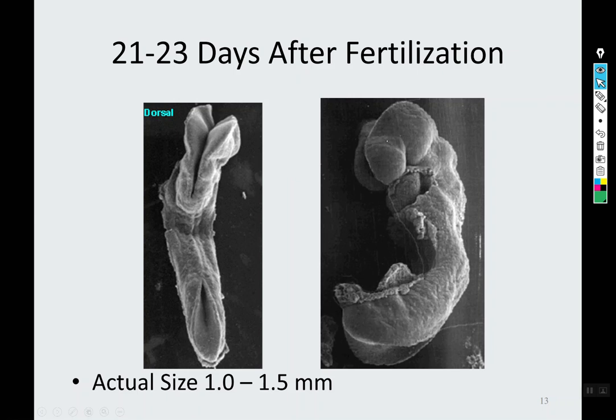This is going to end up becoming the brain and head. This is going to become the thorax and heart. And there's other midline stuff happening in here. So it's all pretty amazing.